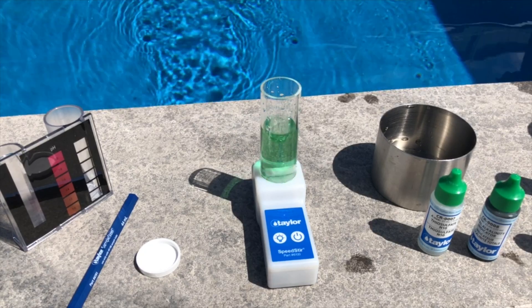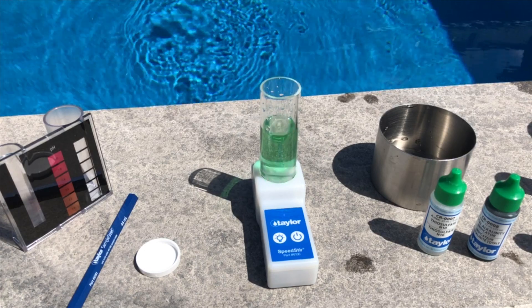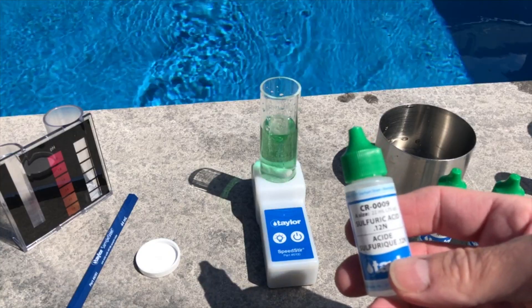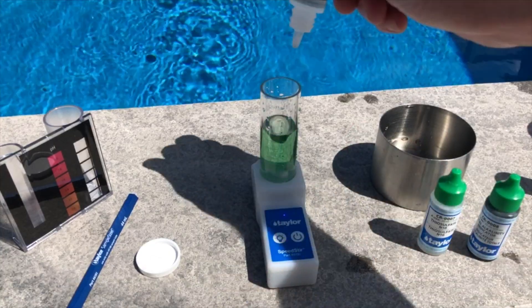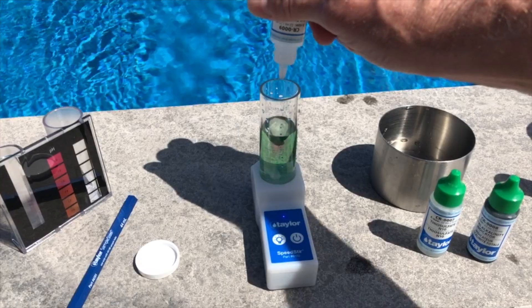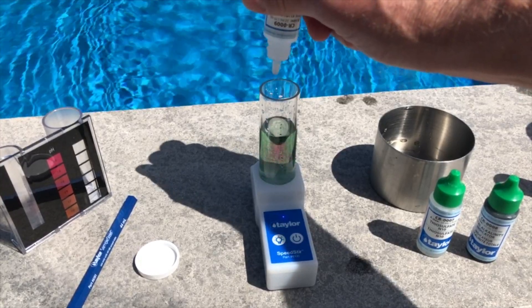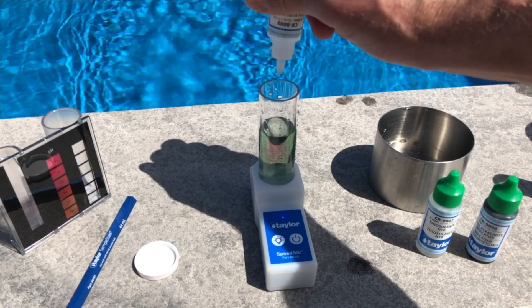The next step is to take the Taylor sulfuric acid, CR-0009. We're going to add these drop by drop and count each drop as we titrate. When this sample turns from green to red and stays red, that will be your total alkalinity — you count the number of drops and multiply by 10. You'll see flashes of red here.